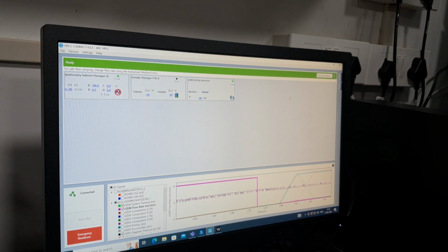And the third scenario: if they want to stabilize the instrument with the flow overnight, like yesterday we gave 0.2, then the instrument cannot be shut down. But last day when we went out around 6:30, right?